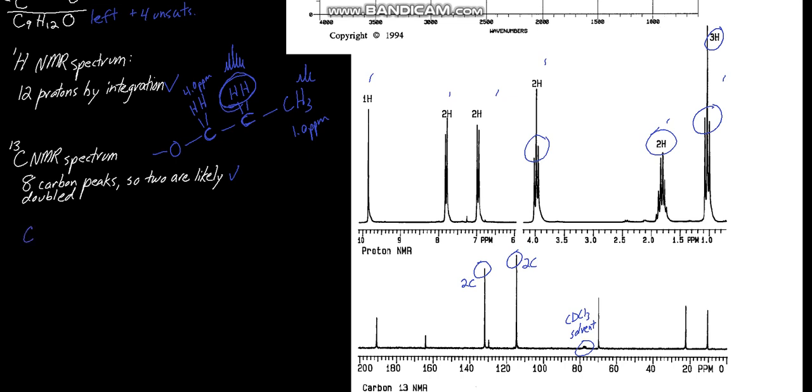So where was our formula where we left off? C9H12O. If we subtract, and that is not the oxygen from the carbonyl, it's this oxygen. So we have C3, we can subtract H3, 4, 5, 6, 7, O. Subtract that. What do we have left? C6, H5.